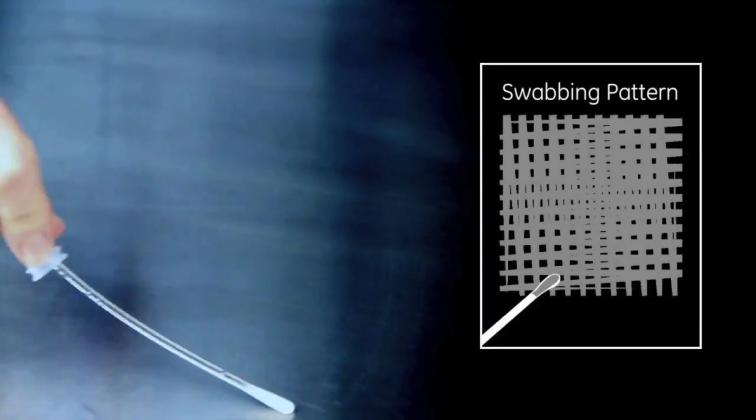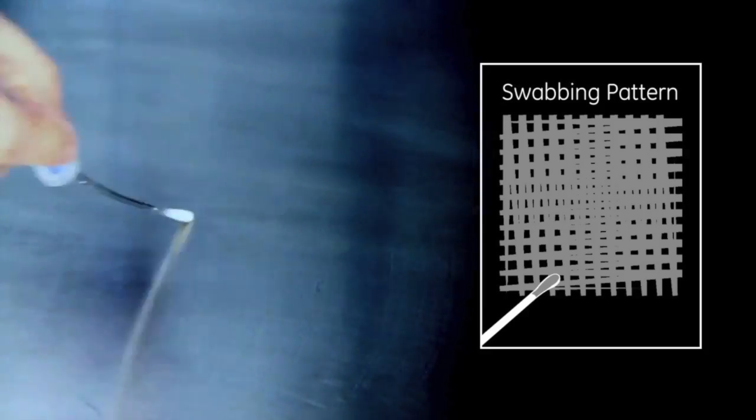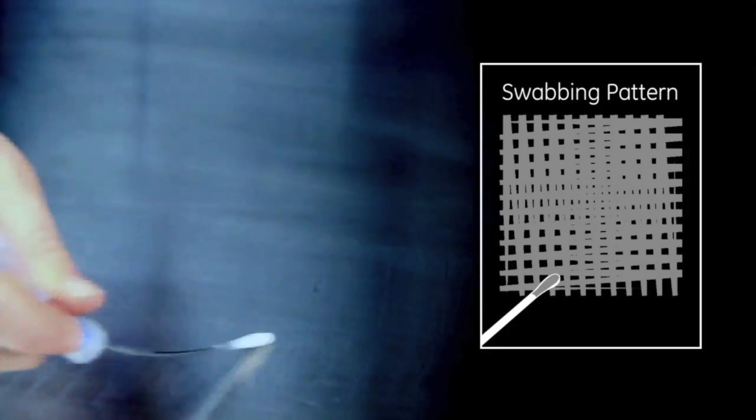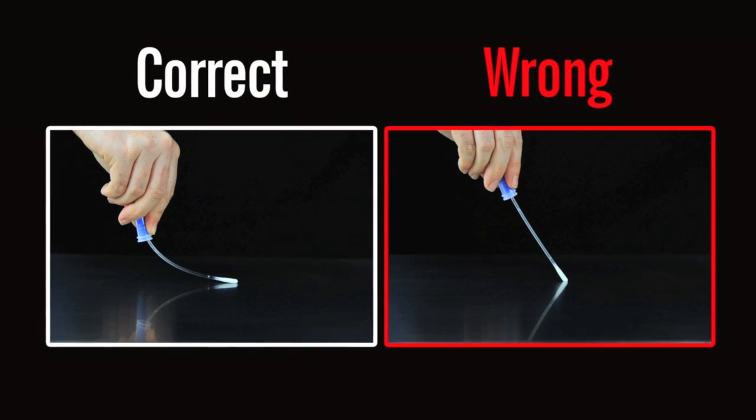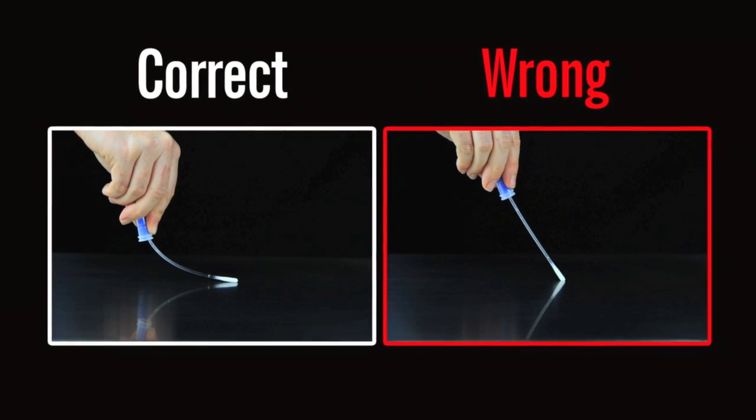Swab a 4 x 4 inch or 10 x 10 cm square area in a criss-cross pattern, swabbing the area with even coverage. Apply sufficient pressure to create flex in the swab shaft.